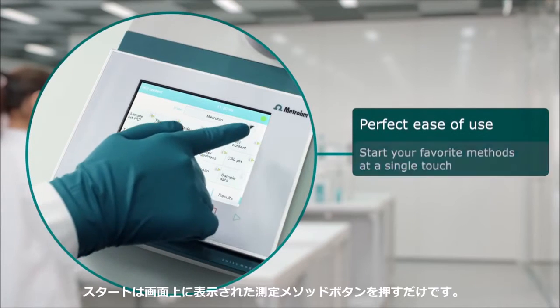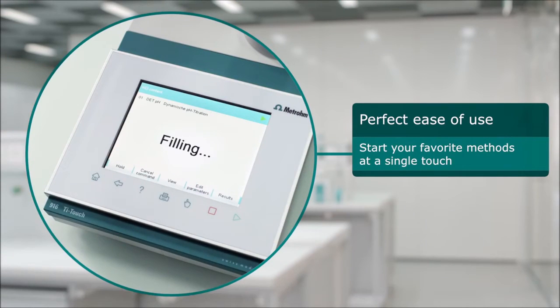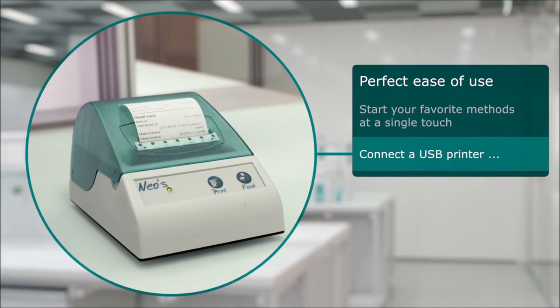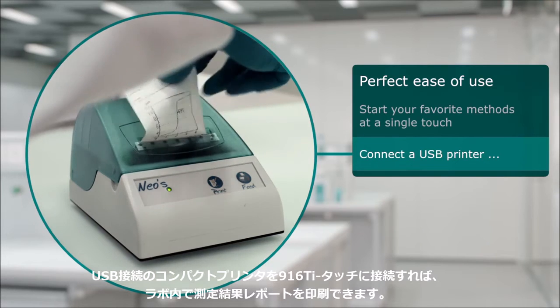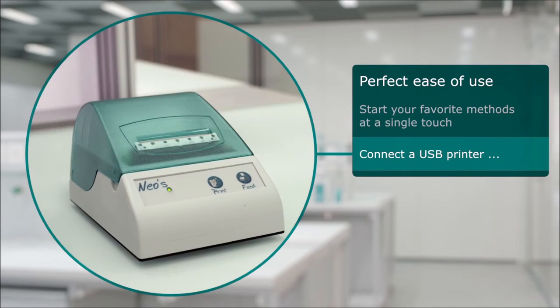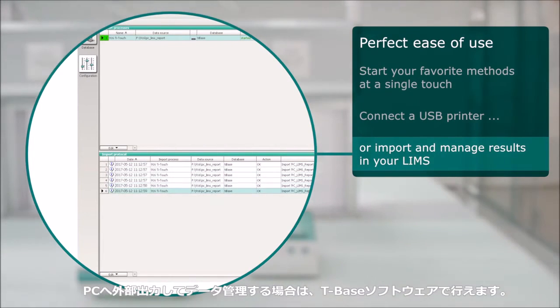Start your favorite methods at a single touch of an icon. Connect a USB printer to your T-Touch and print out a report right in your lab. If you prefer, export results to your LIMS or manage them in our T-Base software.